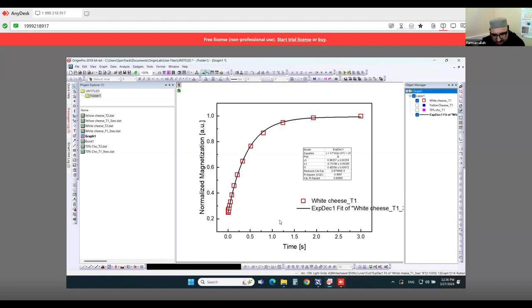Then I will also apply the second function, which is biexponential, and see what happens there. After seeing the amplitude values and their ratios, if it is greater than 10, we see that it is bi. If it is less than 10, we can also conclude it.